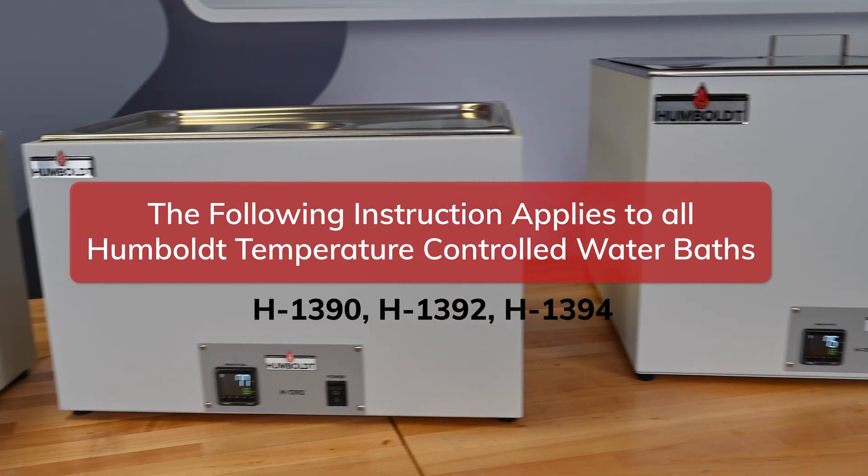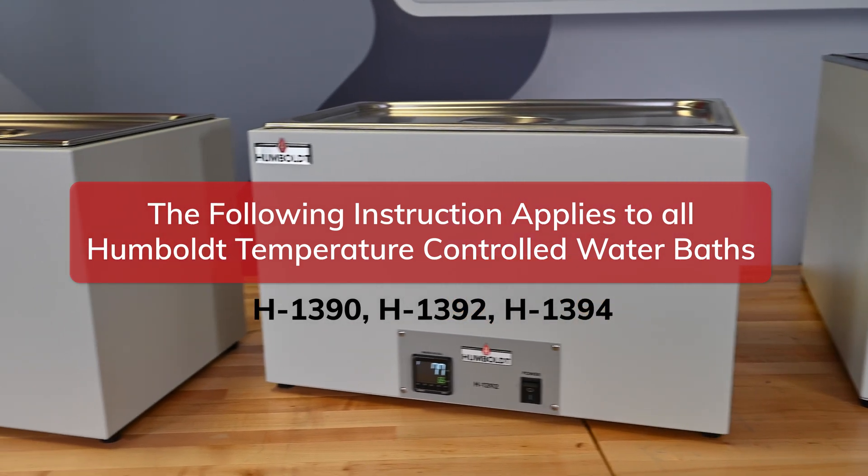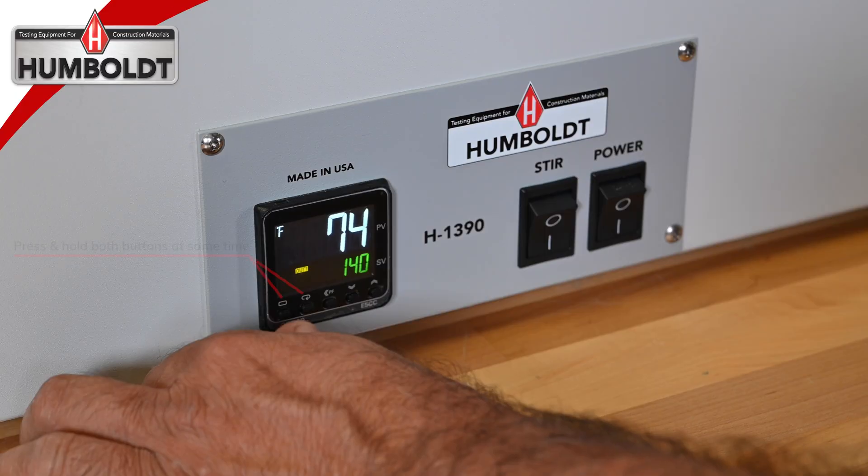This guide will show you how to change your temperature measurement from Fahrenheit to Celsius. First, you will need to unlock the temperature controller.